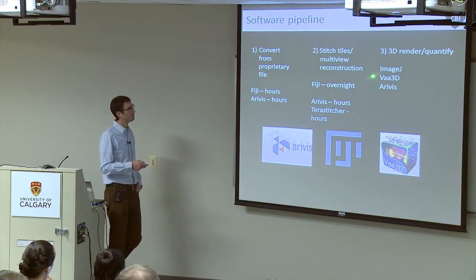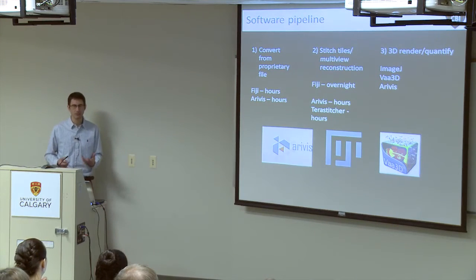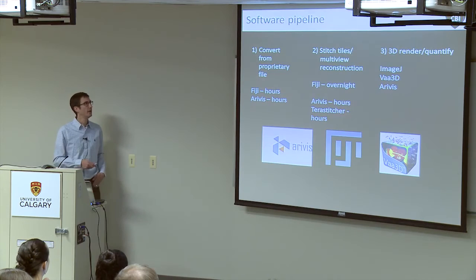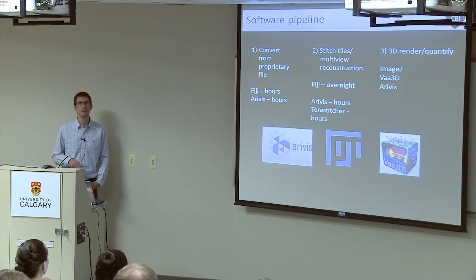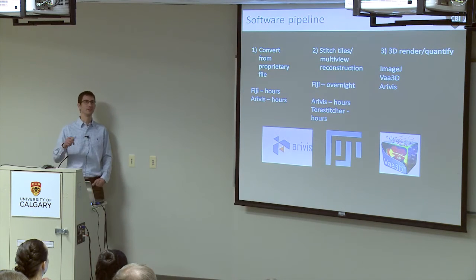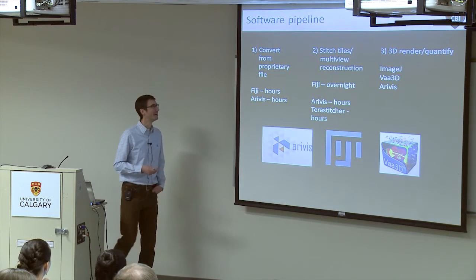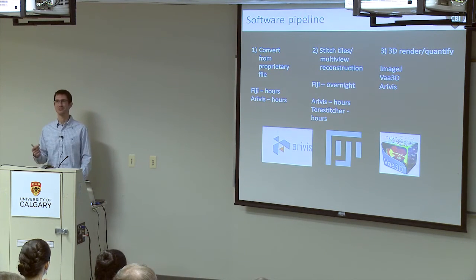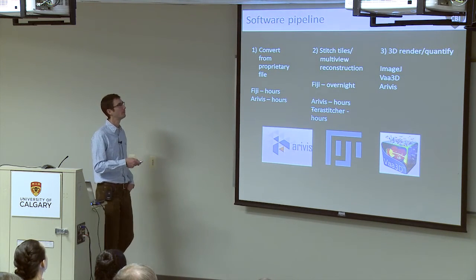All right? The other option is to do it with bead-based recognition. So I showed you those fluorescent beads in the agarose around the sample. And this can be done in Fiji or in Zen as well. I highly recommend Fiji and not Zen. Zen is a little too particular in what it accepts as a bead. And it usually throws out a lot of your beads, and it also takes a pretty long time.